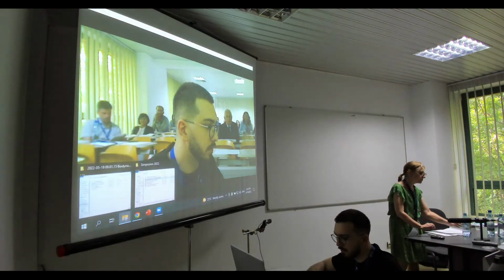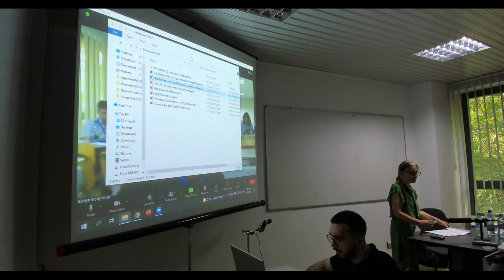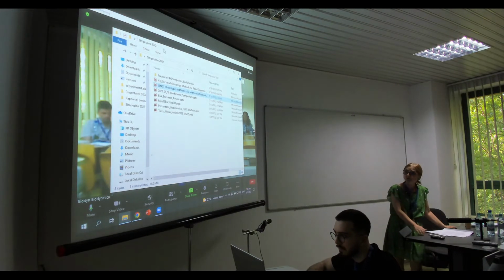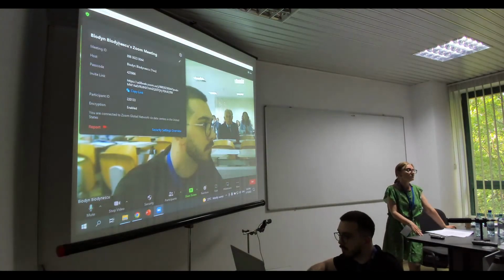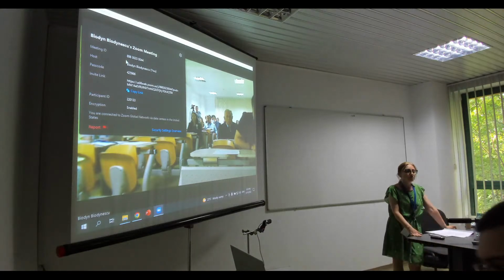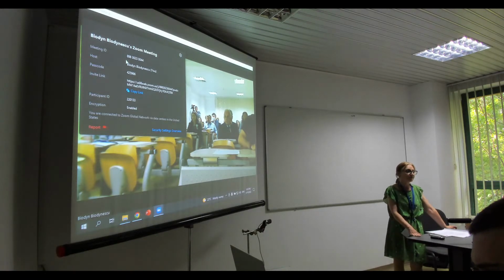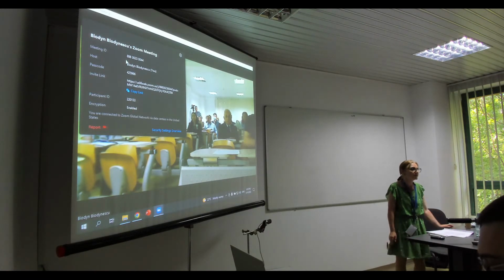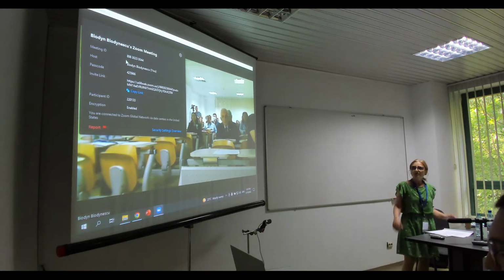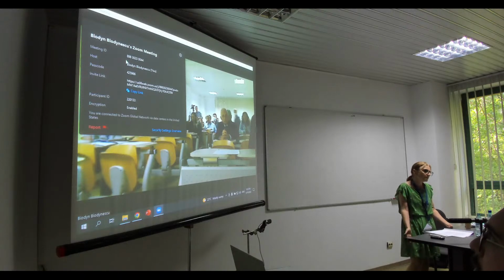After Dr. Florescu introduced us to the state-of-the-art presentation in the available methods in the microbiology laboratory, now I will try to come with a researcher point of view and show you our efforts in using flow cytometry for the rapid detection of pathogens and antibiotic resistance directly in clinical samples. Of course, there is a long way from the bench to the bedside, but we are at the start and we are very open to collaborate.